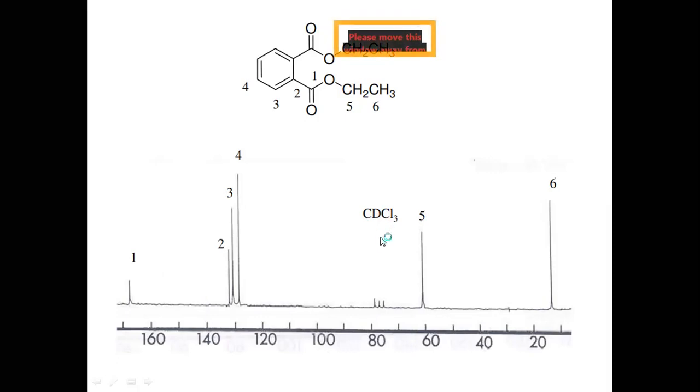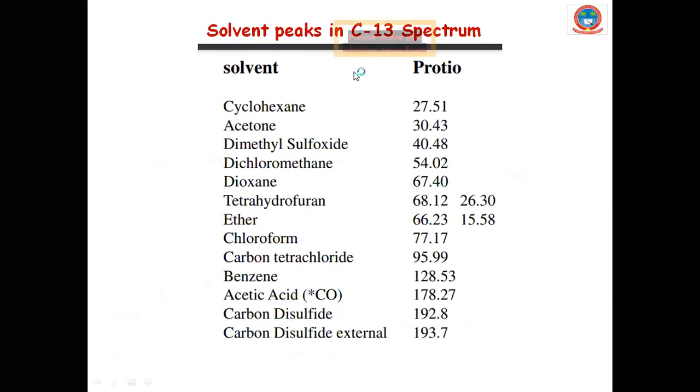This is one more piece of information we have just now come to know: decoupling means only with hydrogen directly attached or at large distance. But whenever we have other heteronuclei other than hydrogen, they are coupling with the carbon even in the totally or broadband decoupled spectrum. So hope all of you understand the meaning of broadband decoupled, off resonance, and totally decoupled spectrum.